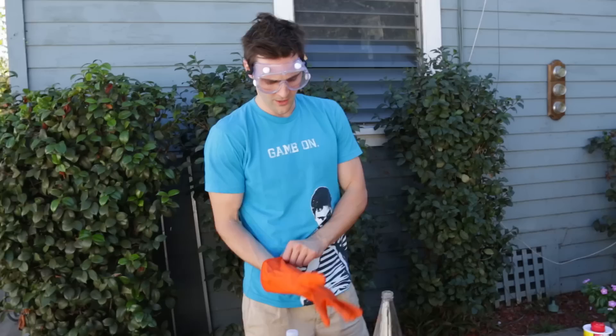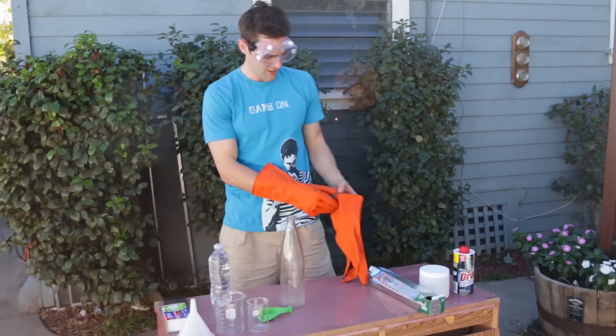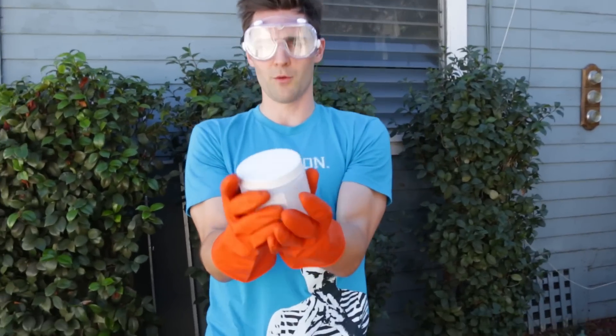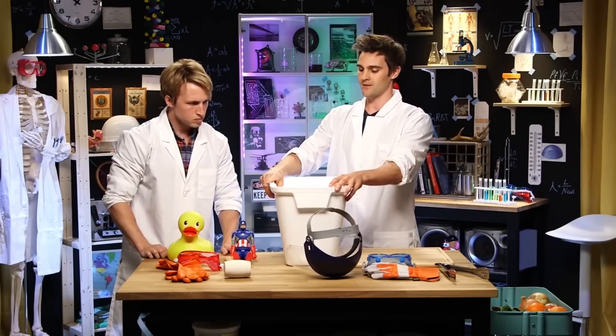Sodium hydroxide — also called lye — is what's used to make soap. If you have any type of oil or fat and you mix it with lye, you get saponification. We're doing this experiment because we do all the workups for Smosh Lab.